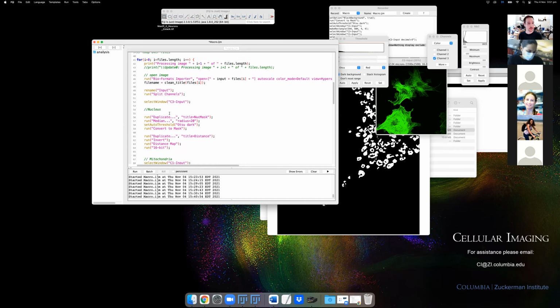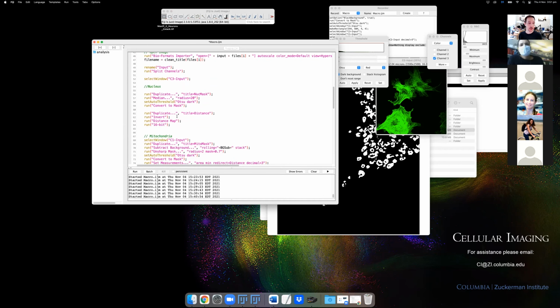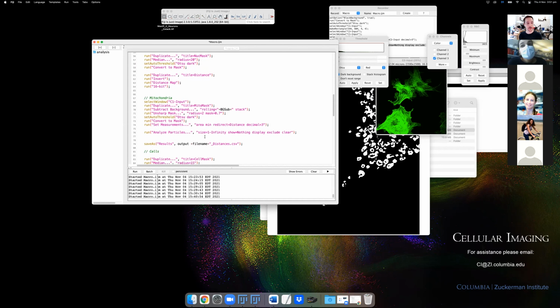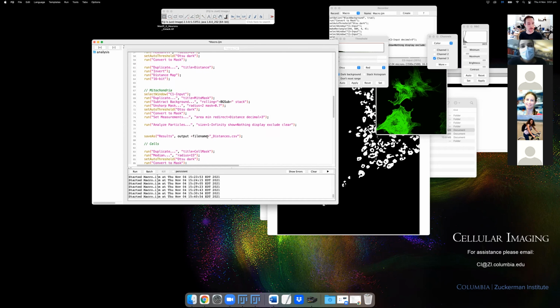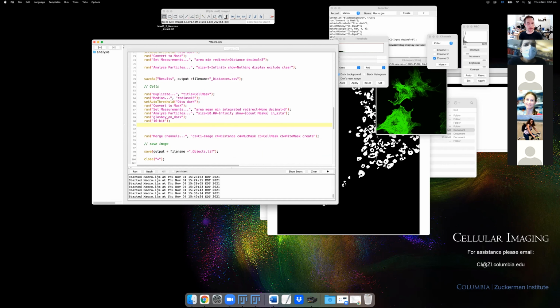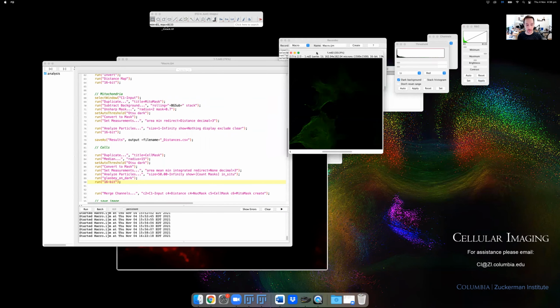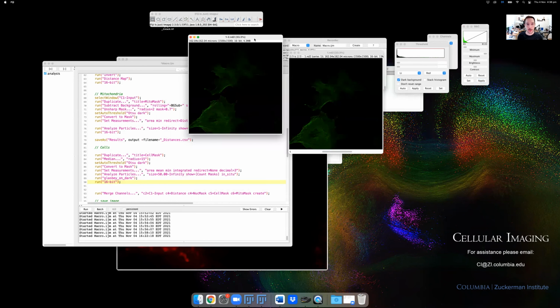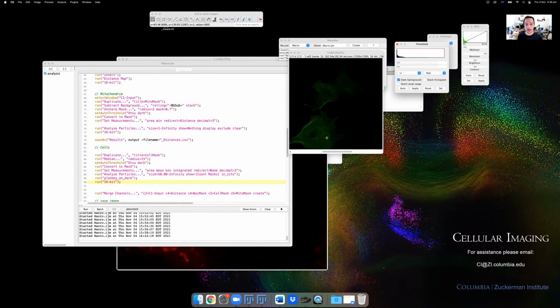Okay, so I think we've added a fair bit in here. It's not uncommon that when you add a whole lot like this and you haven't been testing things out, it's not going to run properly, but let's just see how we go. Actually, let's just see how this will work before we run it. Let's duplicate the cell channel. Actually, what might be easier is to work on the mitochondria channel. So let's work on the mitochondria here.